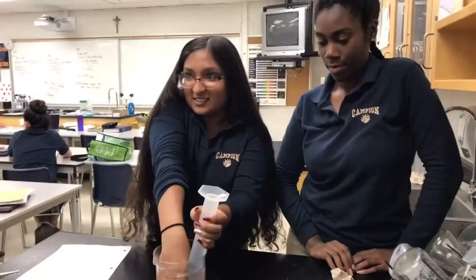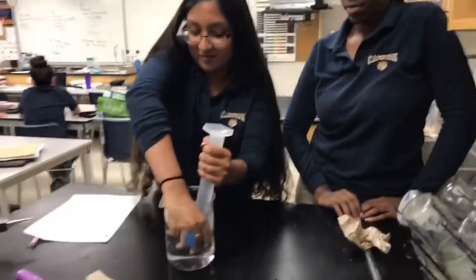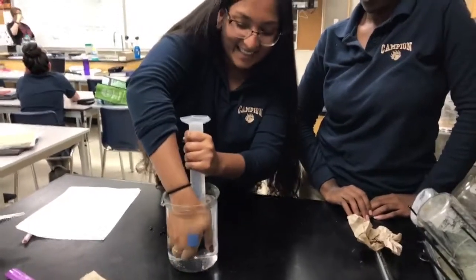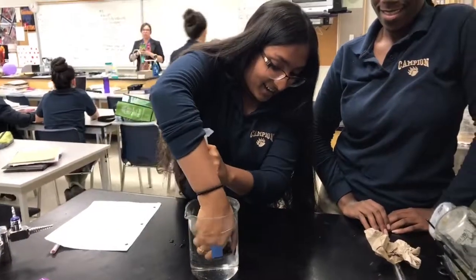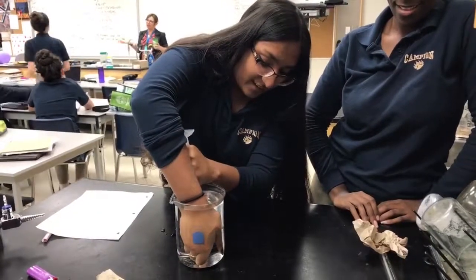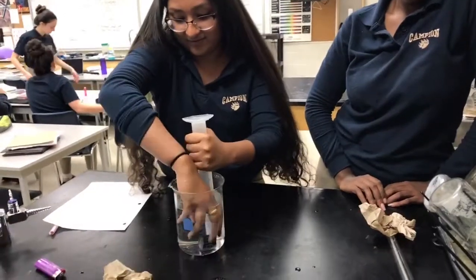submerged upside down. Right now, we are doing a lab called the molar volume of butane, of which we're going to measure the molar volume of butane. Right now, Manisha's trying to get the stopper off the top of this graduated cylinder, and she's kind of struggling. Oh, got it. There we go. Keep that submerged.